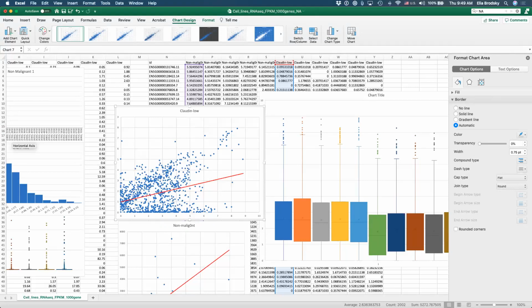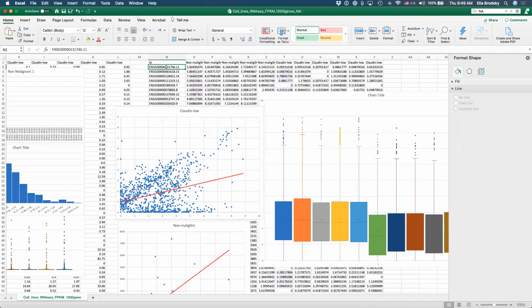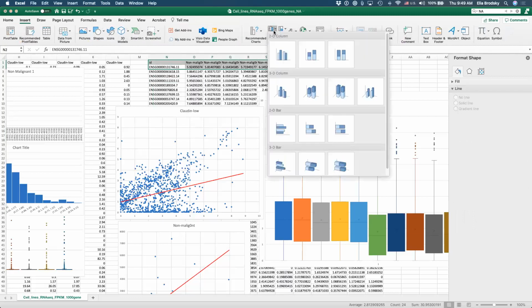All right. Okay, so how do we biologically interpret the dots? So the dots are genes, right? So if I take any dot here, I can find this dot, and this dot represents a gene. So if I want to compare a single gene, let's take this gene, for example, I can create a bar plot.